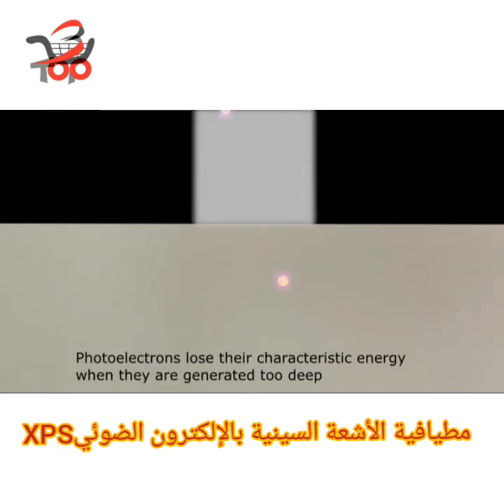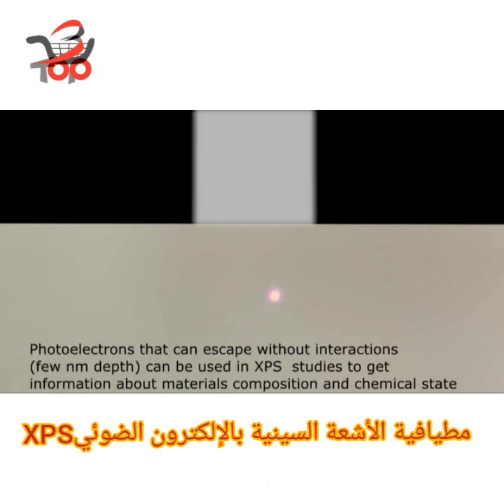The exciting X-ray radiation can penetrate tens of microns deep into the substrate and generate photoelectrons at various depths, as long as it has sufficient energy. Some of these electrons will never get out, as they lose all their energy by interacting with the material. Other electrons may escape, but as they lost energy in interactions with the material on their way out, they no longer carry usable information about the material.